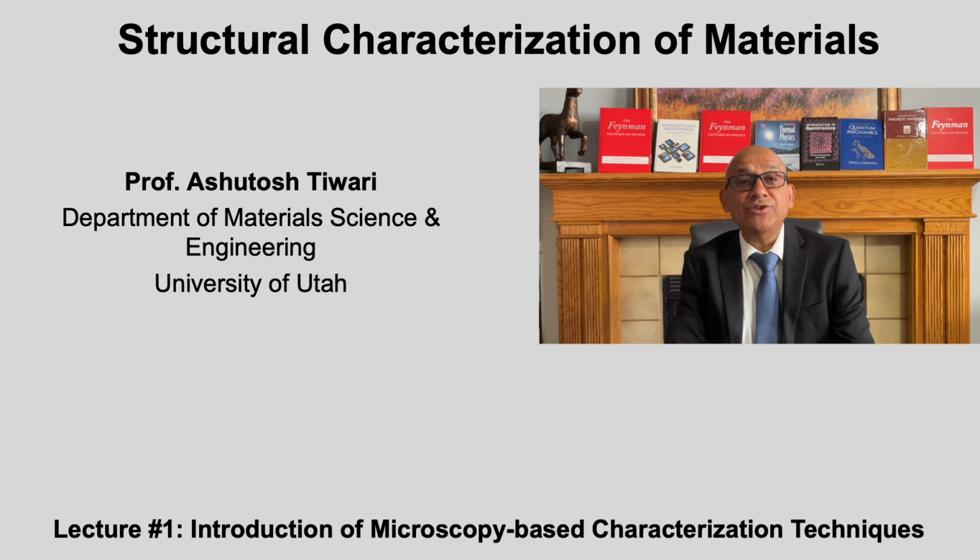The first two lectures of this course are introductory. Their goal is to provide a broad, unifying overview of the major structural characterization techniques used in materials science. Rather than immediately diving into detailed theory or instrumentation, these two lectures will help you see the full landscape of characterization tools and understand how they complement one another.